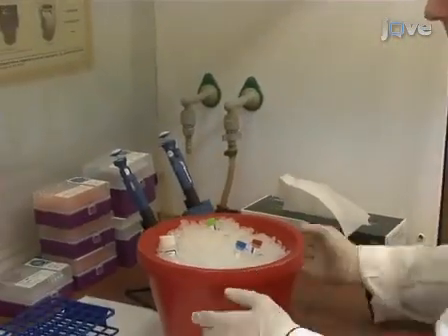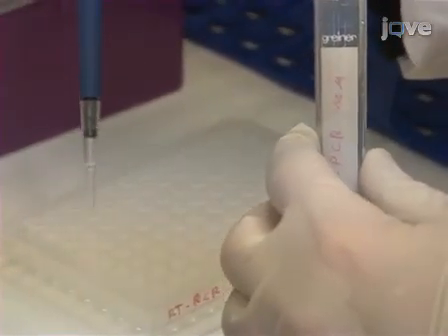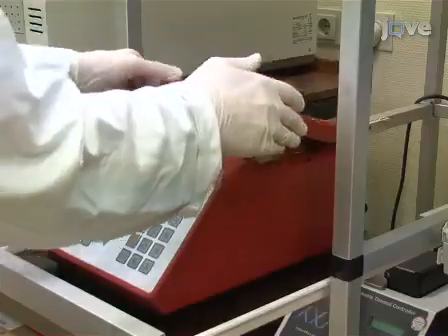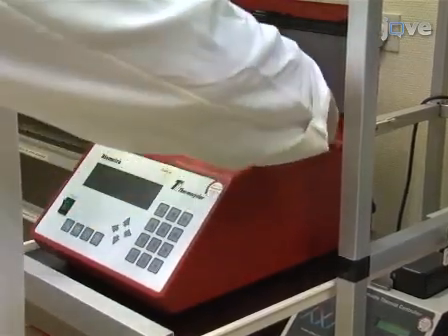To generate and amplify cDNA of the viral genes, carry out reverse transcription PCR using the one-step access RT-PCR system in 25 microliter reactions as described in the accompanying written protocol. Once the PCR is completed, the samples can be screened for AIV positivity and purified.